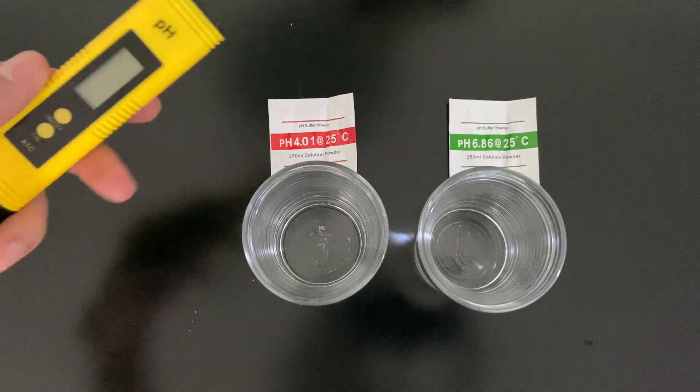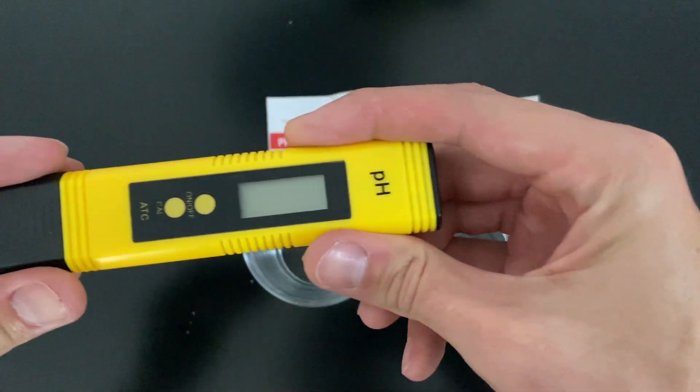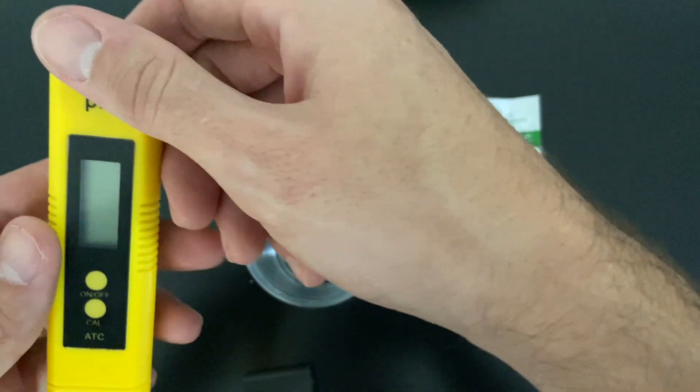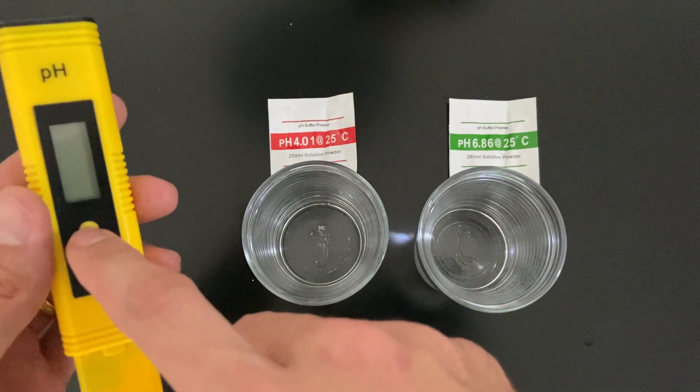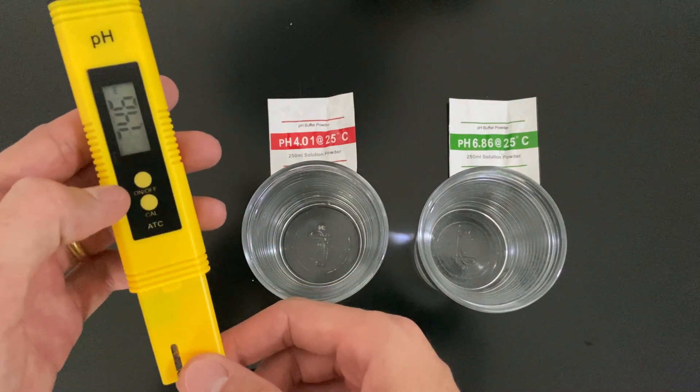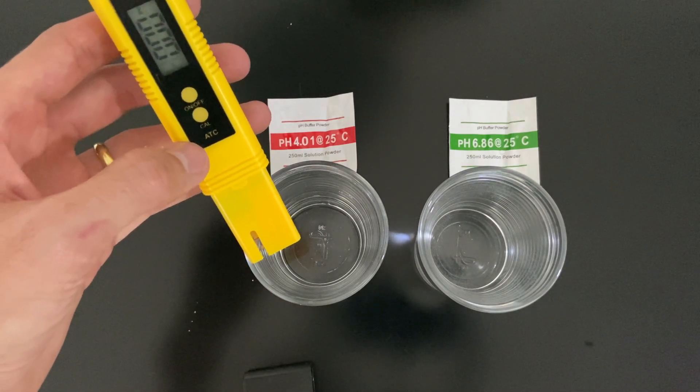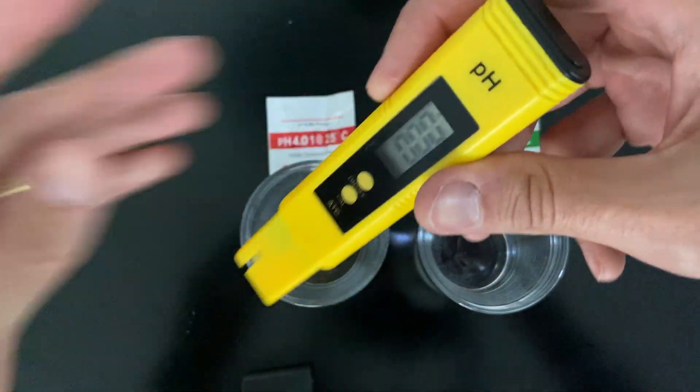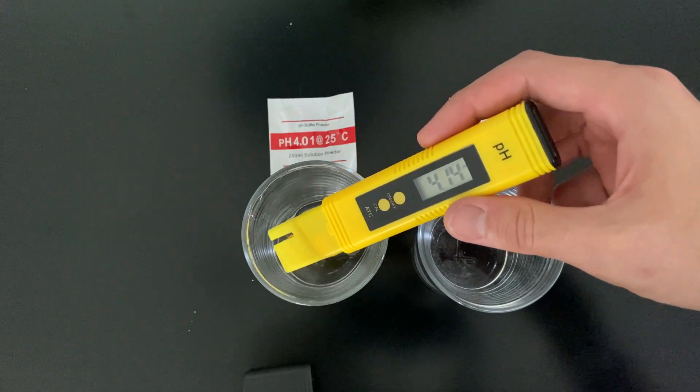Now let's put it to the test. I have already calibrated this system. To calibrate, you need to open the cover here, click the on button, and put this instrument into the water. Then you can get the value here.